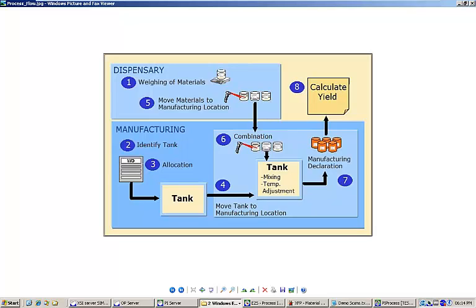Next, we'll mix our solution and perform a temperature adjustment. Finally, we'll perform our manufacturing declaration and calculate the yield of our batch.